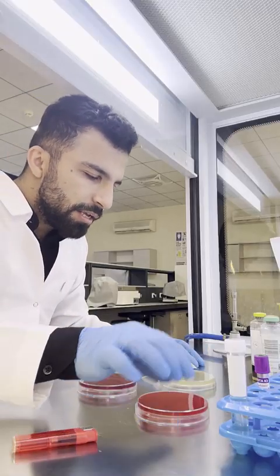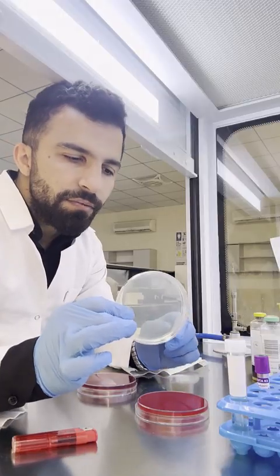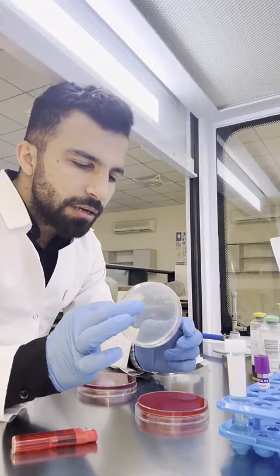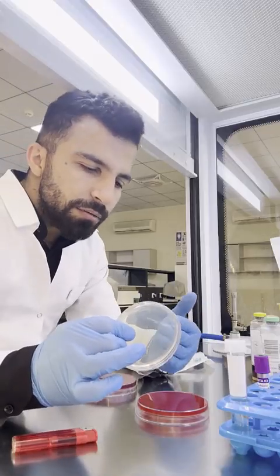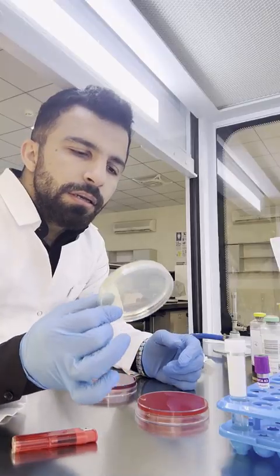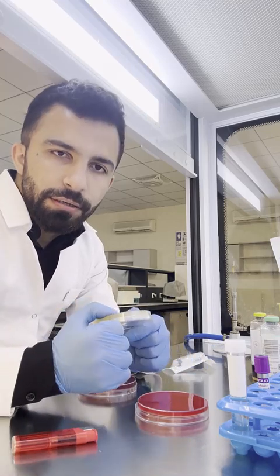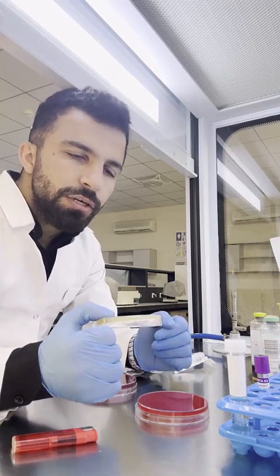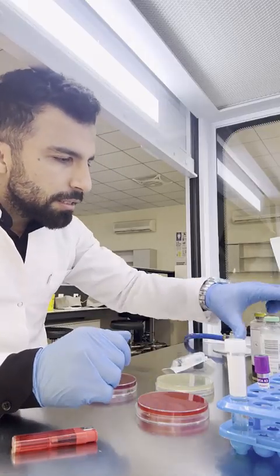And then we have the nutrient agar. This nutrient agar is a non-selective and non-fastidious agar. By non-selective, we mean it's quite contrary to MacConkey agar. Nutrient agar is non-selective, which means all the bacteria can grow on this agar, which is a general nutrient agar for growth.